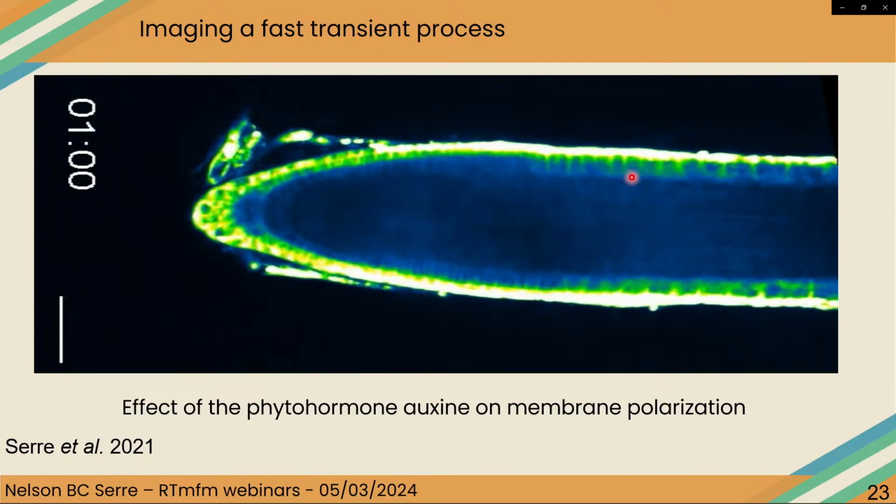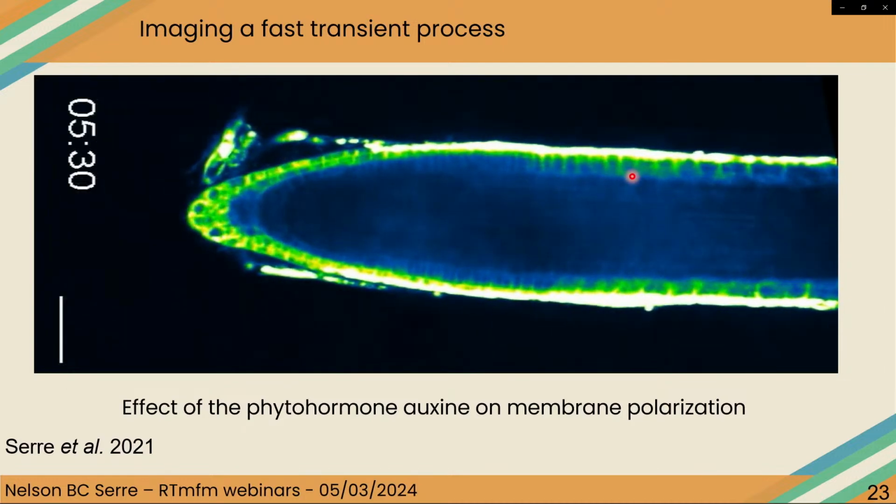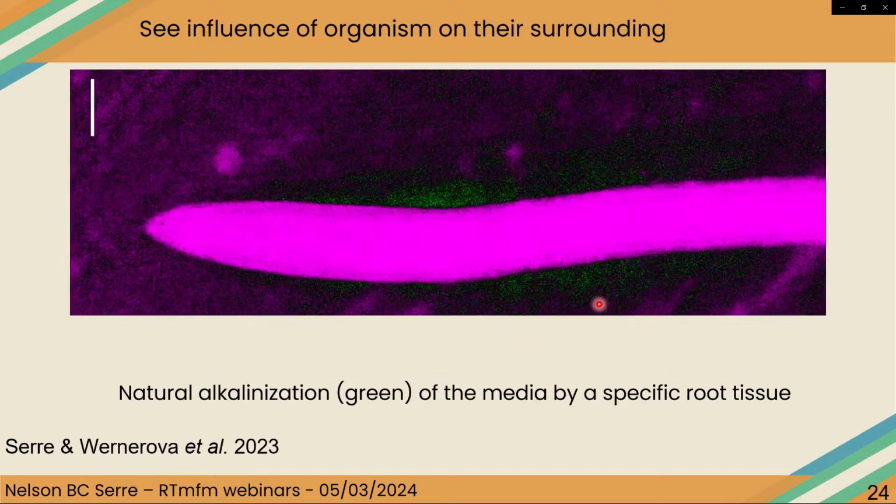Yes. So here it's going to increase in fluorescence in a very fast way. Then you can also do some more play with the liquid flow, basically.